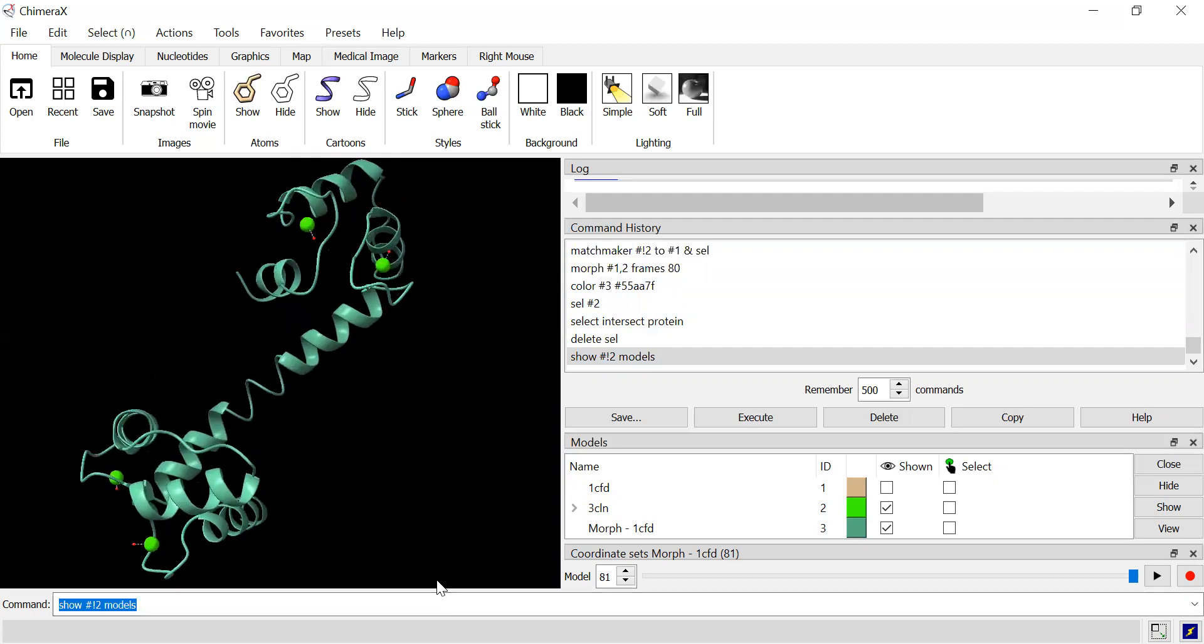Simple, nice and easy. And the reason you'd want to put it in the command line is it's much easier to create a script out of it, which is invaluable if you're creating any kind of movie or just trying to save scripts to make your life easier.